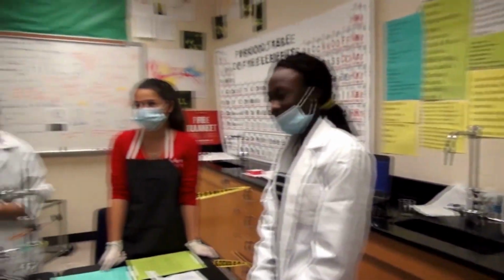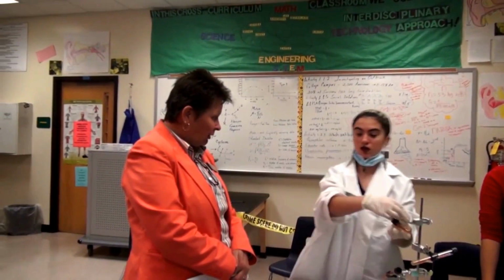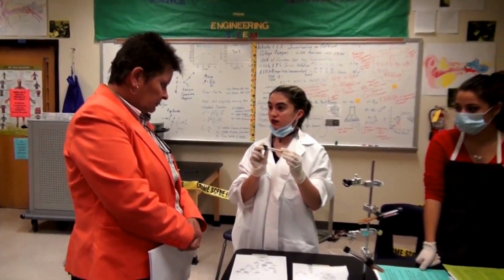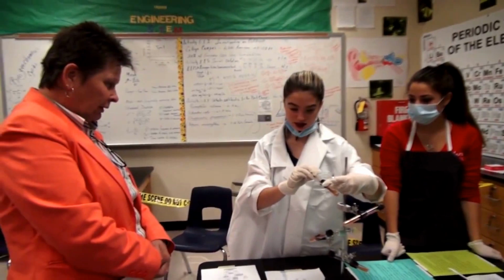Yes, definitely. We even swabbed the school. You've got people walking around with MRSA? Yes, ma'am. And we swabbed the girls' weight training room. It's downstairs, and in fact, it grew MRSA right here. And we've had it sealed. So you're allowed to grow that? Yes, ma'am, because it is sealed professionally.